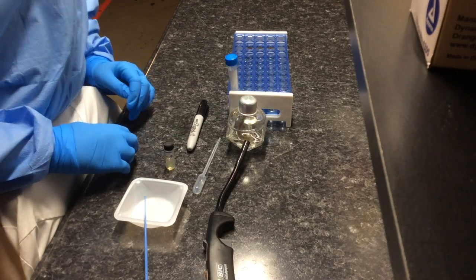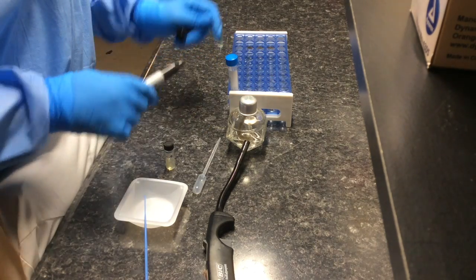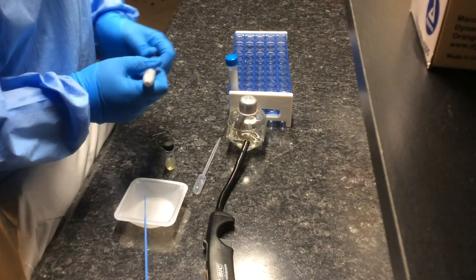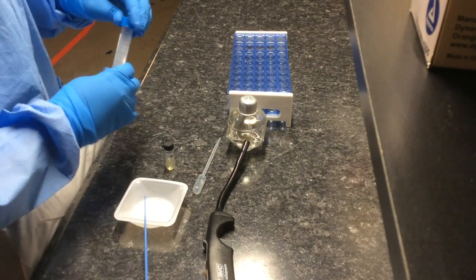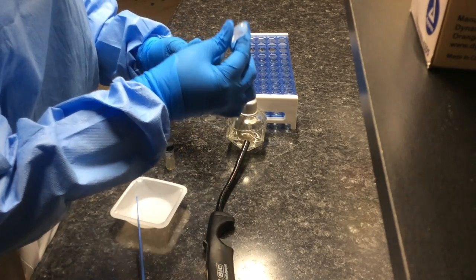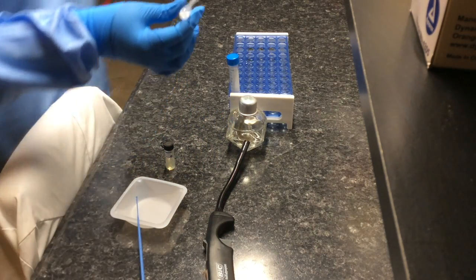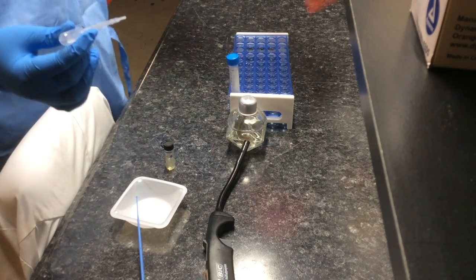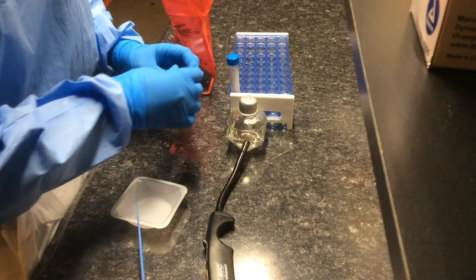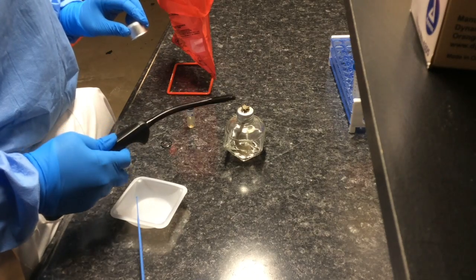Today I'm going to show you how to make a bacterial smear. The first thing you want to do is get a glass slide, put the back side of it, and make a circle. Then take a tube of distilled water and a dropper and place a few drops of distilled water on it.